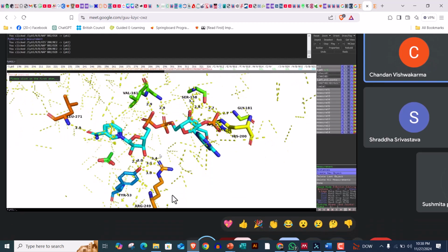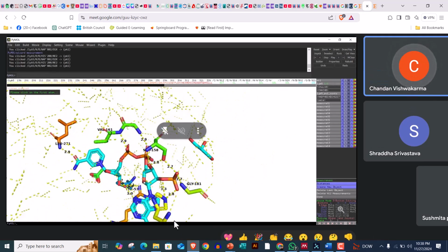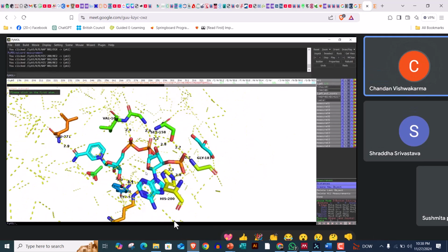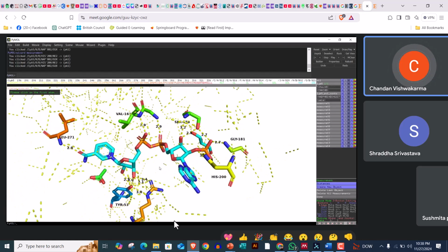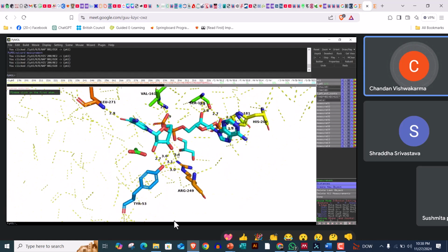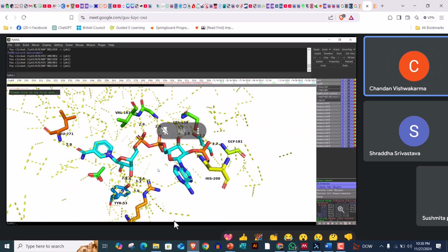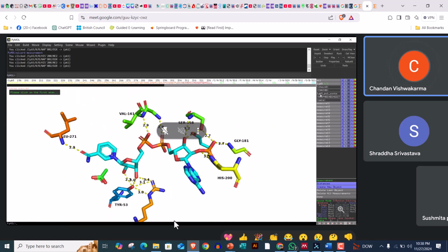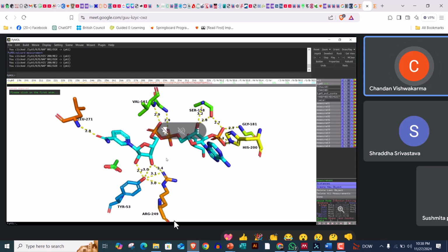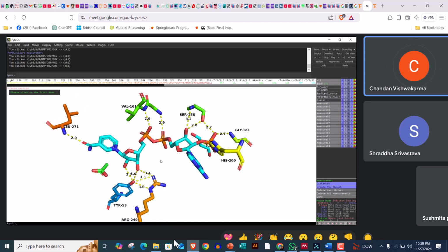Yeah. Okay. So I have shown every interaction. Is anyone missing? You can look at this one and find whether anyone is missing or not. Everything is intact. Each residue is intact. I have done it for each residue. Now what you do is just hide the polar contact here. Now you get this nice interaction diagram. Now if you want, you just select the whole.